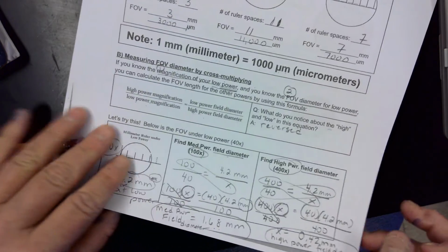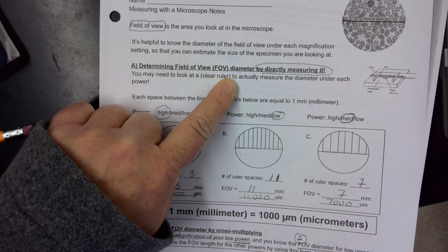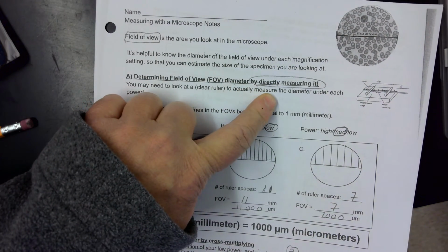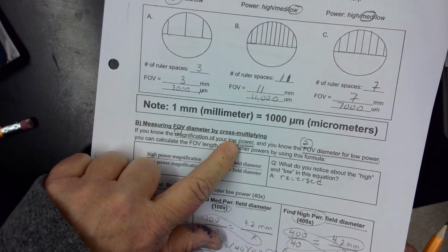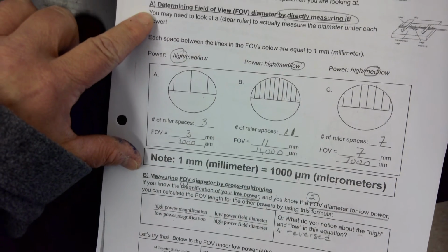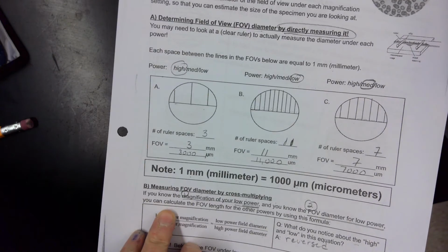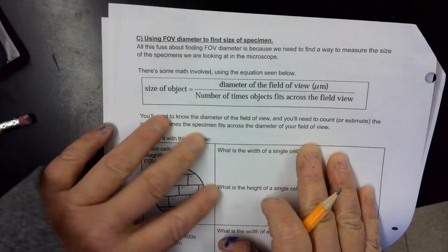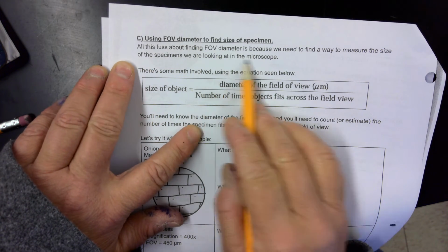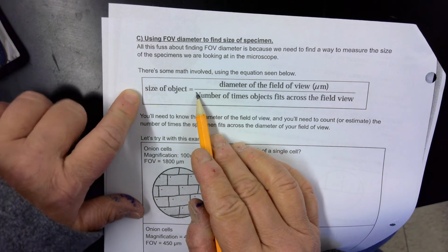Okay, well, now we've spent a lot of work doing two things. We first measured the field of view diameter by directly measuring it. If we couldn't directly measure it, we had to use a proportion, and we cross-multiplied. But both of those skills that we just worked on were finding the diameter of your field of view. So what's all this fuss about finding field of view diameter? It's because what we're trying to do is find a way to measure the size of the specimens that we're looking at. So here's the math that you're going to need.